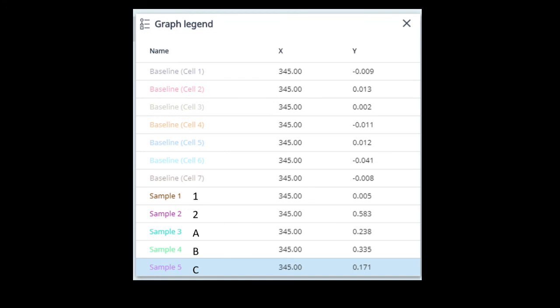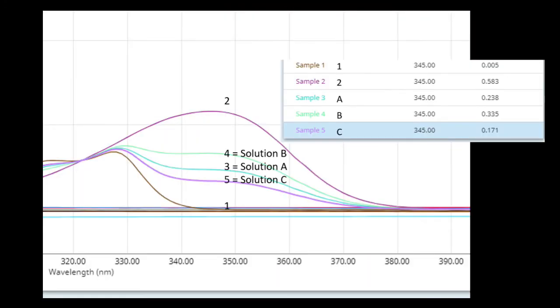So it's really 1, 2, A, B, and C that we're interested in, and gives the absorbance values of those 5 samples. And then this last slide just shows a blow up of the relevant part of the absorption spectrum for solutions 1, 2, A, B, and C, and then it also gives the absorbances as well. So we're basically up to the last part of this lab. And what remains is we have to find the transition energies, the delta E's between the ground and excited state for the NOH as well as the NO- form.